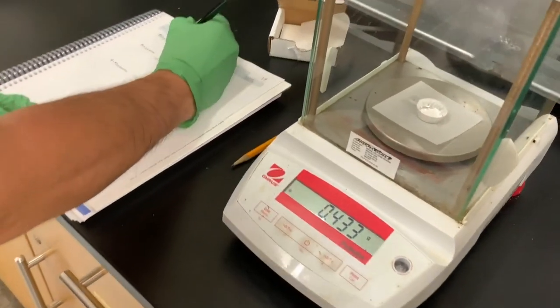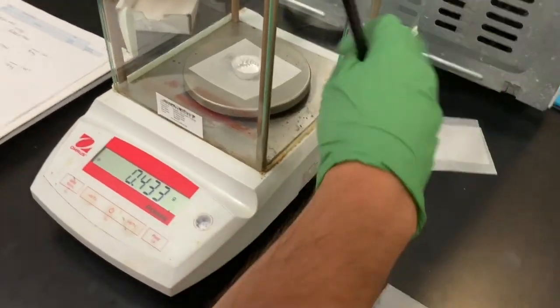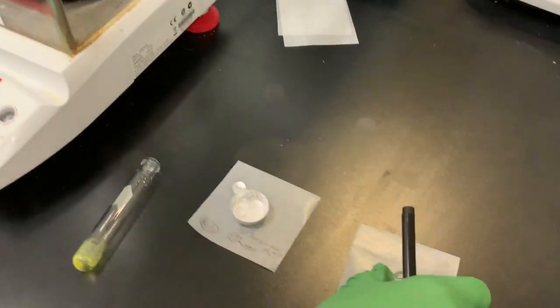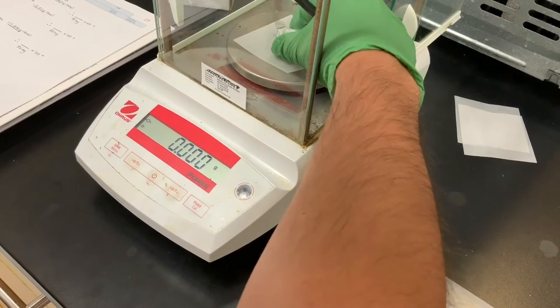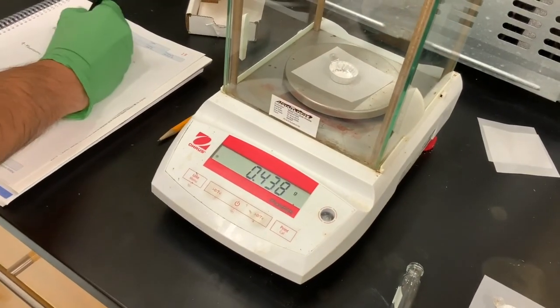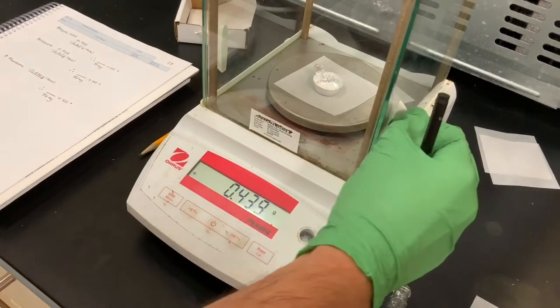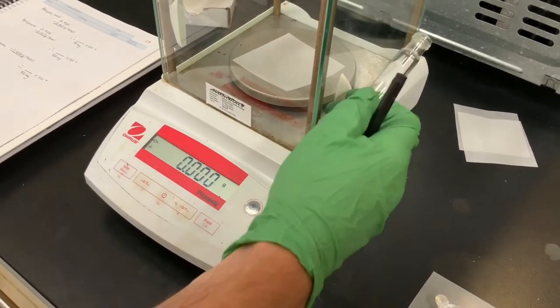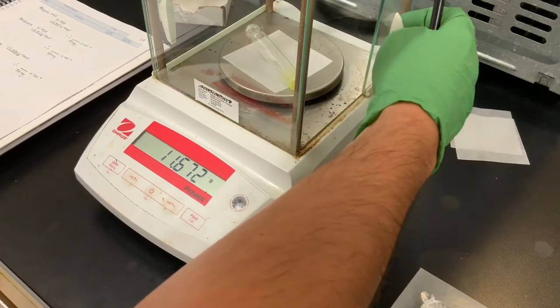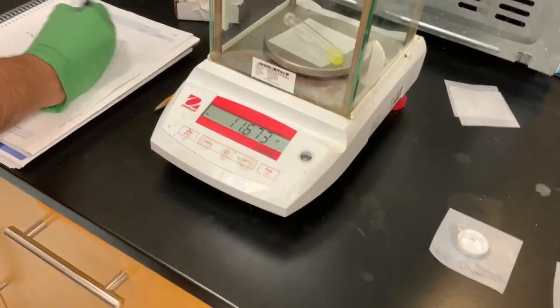So this is 0.433, that's for benzoic acid. Tare it in between, just to be safe. Here we've got now benzocaine, and we've got 0.439. Tare it. And now for our culture tube with the fluorenone, 9-fluorenone. It's 11.673, all right? So those are the masses of each of these.